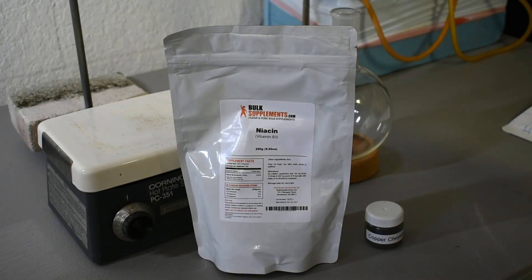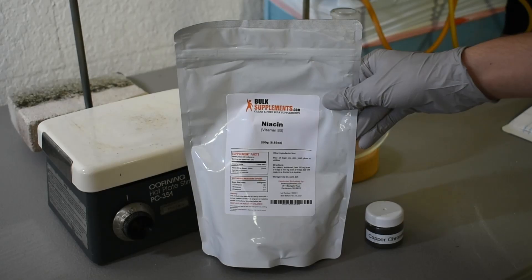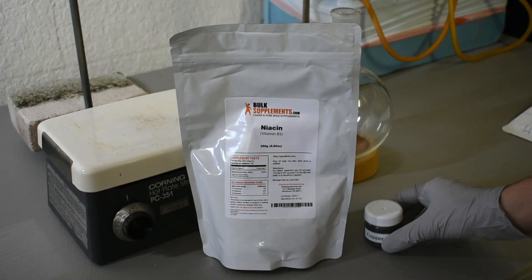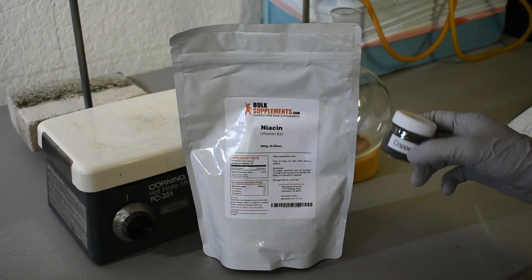Hey guys, today we're going to make some pyridine by decarboxylating niacin using the copper chromate I made in my last video.